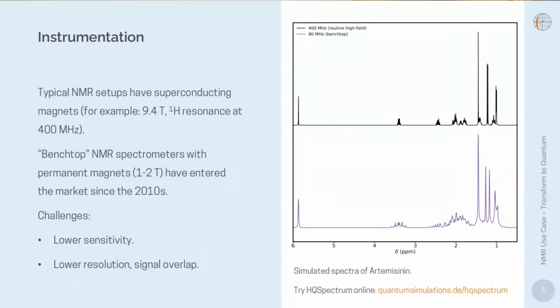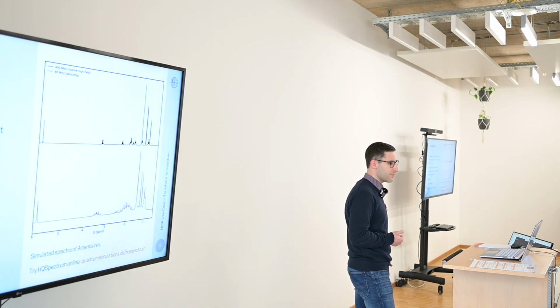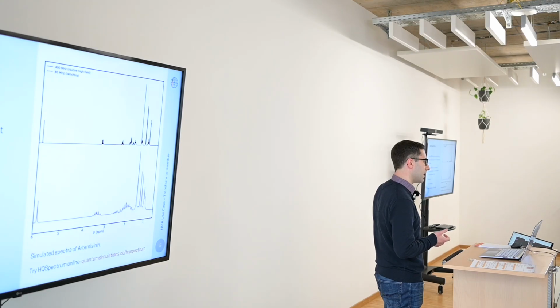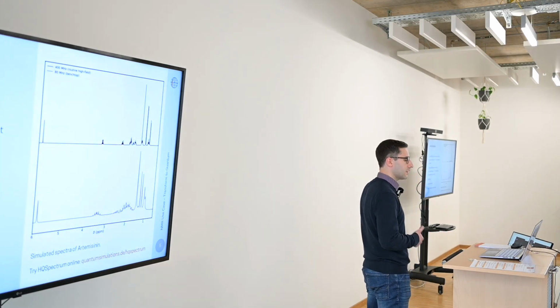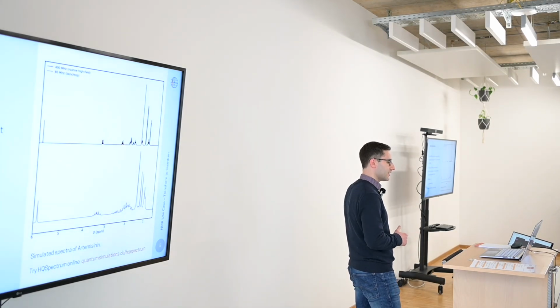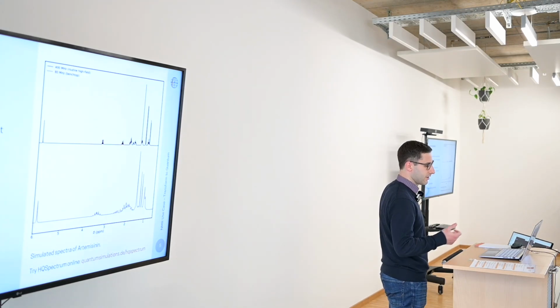It's actually a bit of an irony of the history, because the earlier NMR spectrometers used to have first electromagnets, then permanent magnets, and then development went towards superconducting magnets. But for some applications, you may actually want to go back to permanent magnets, and it's the development of magnetic materials that permitted benchtop NMR spectrometers to be constructed nowadays, as opposed to the extremely big machines you used to have many decades ago that employed permanent magnets that needed to be much, much larger than they are nowadays.